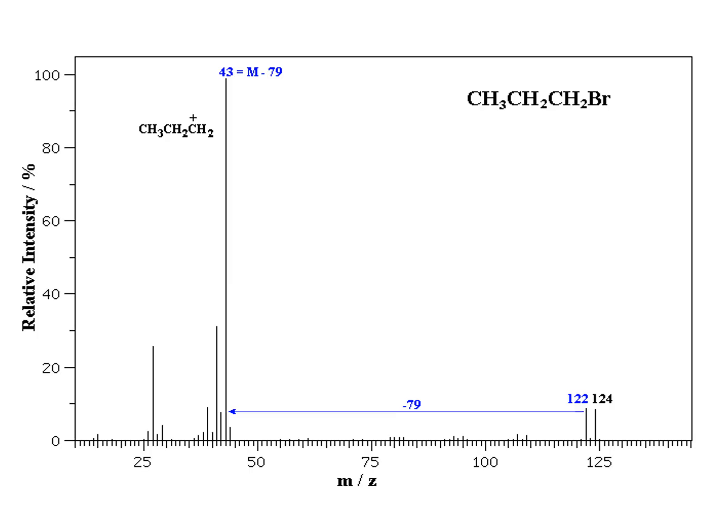When we fragment, we do the same thing. We break the molecule up into different pieces, and when we identify the pieces based on the mass-to-charge ratio, we are then able to put those pieces back together and see the entire picture of the molecule.